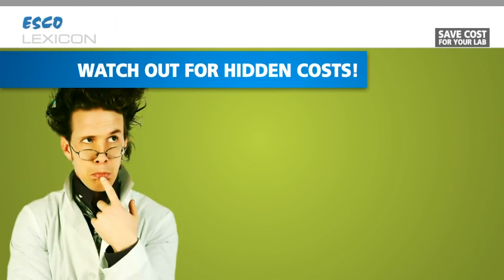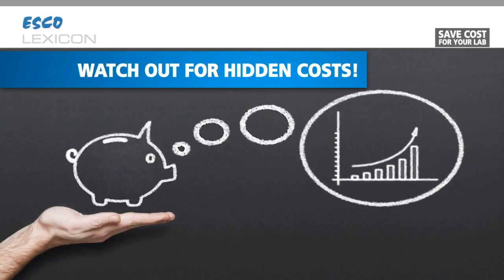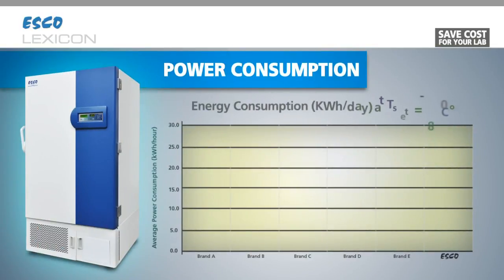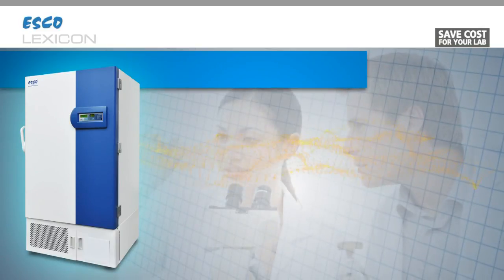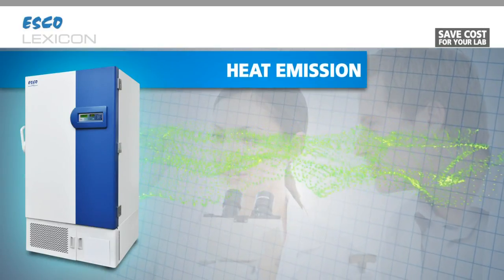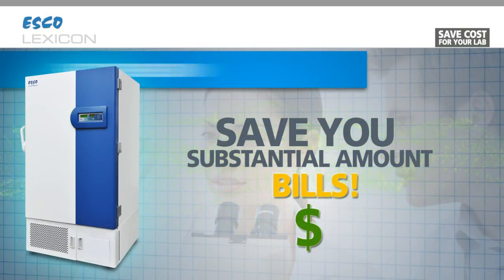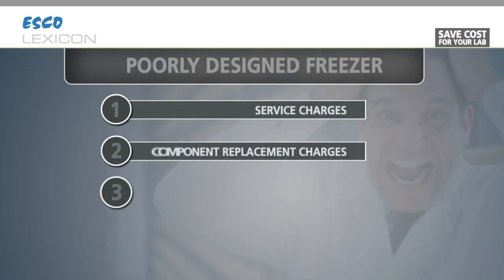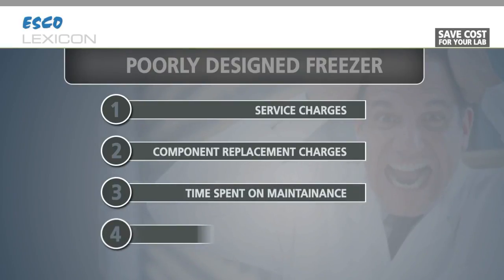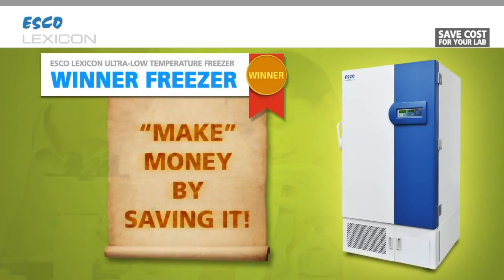A good freezer may or may not cost you much when you purchase it, but it can certainly save you thousands of dollars in the long run. To calculate the hidden cost, ask for the average power consumption. Compared to an average freezer, I use merely less than half of the electrical energy. Ask for the heat emission to ambient — a better designed freezer like me releases less heat to the lab and will save you a substantial amount on your air conditioning bills. Add on service charges, component replacement charges, and time spent maintaining a poorly designed freezer away from research, and purchasing a Lexicon freezer could actually make you money by saving it.